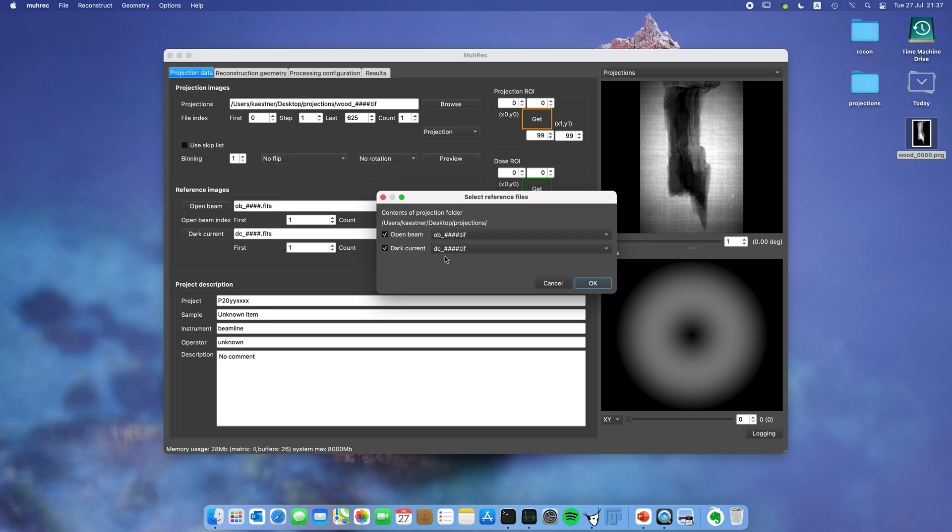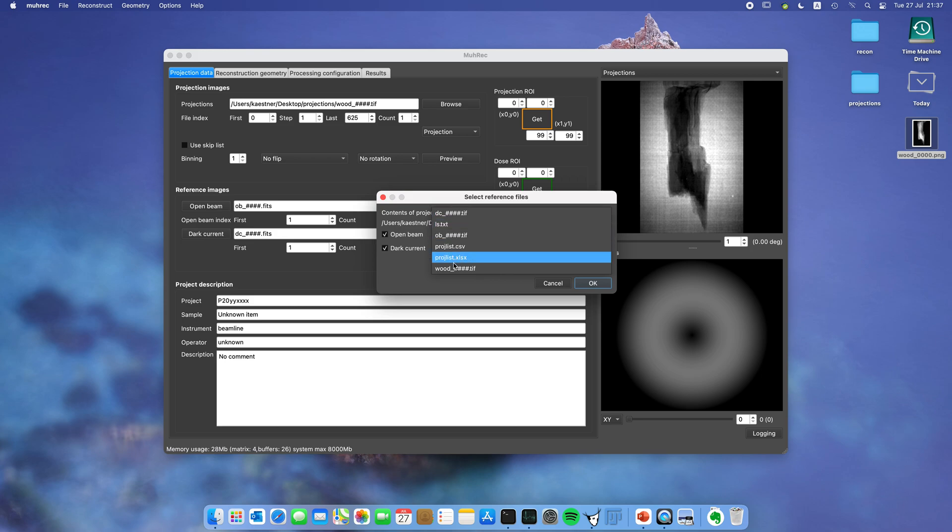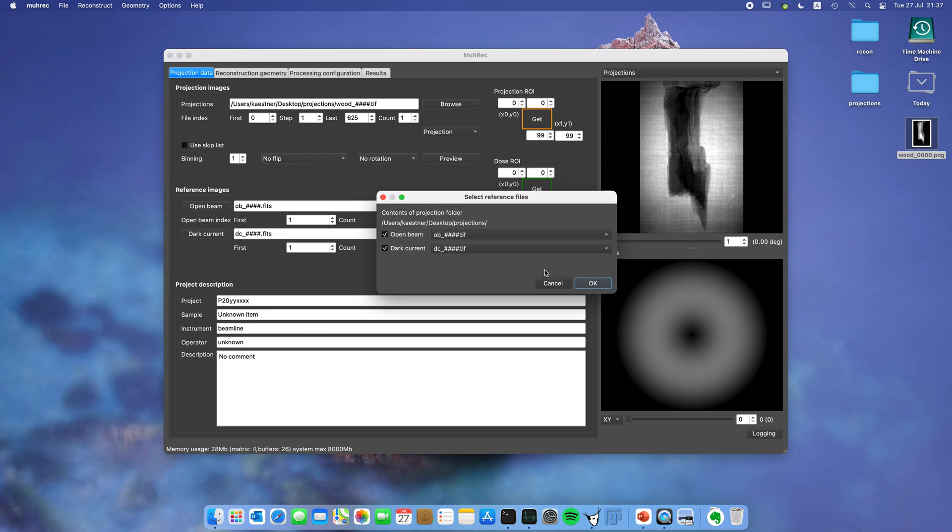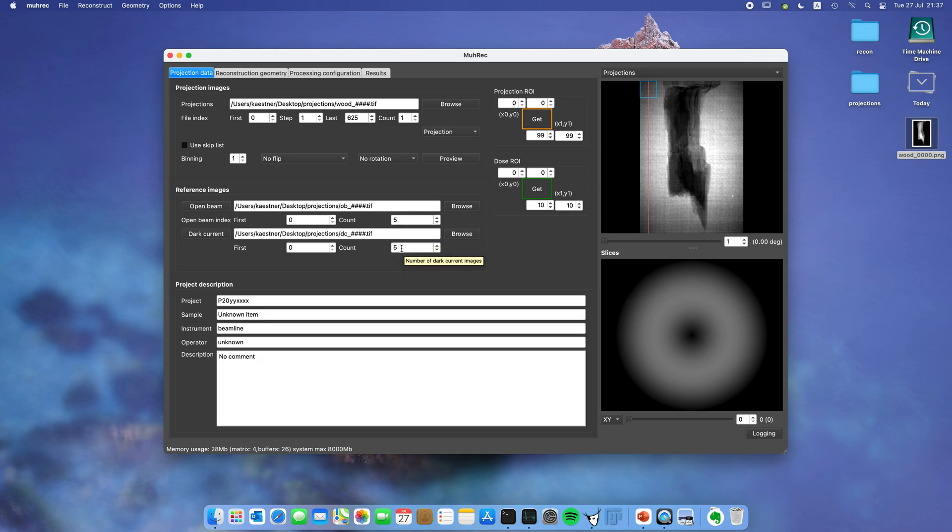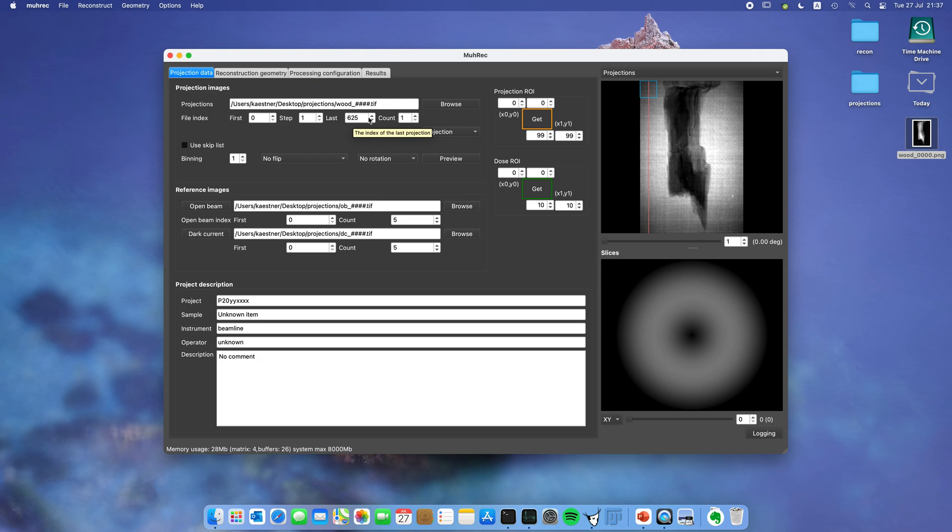You can see this dialog which shows you suggested open beam images and suggested dark current images. If they're correct you can just choose to take them, or you can click on this combo box and see different options. In this case it's actually correct, so I click OK. Then it fills in the file names of open beams and dark currents. You can see here that you have five of these and five of these, and you have 625 projections in the projection data.